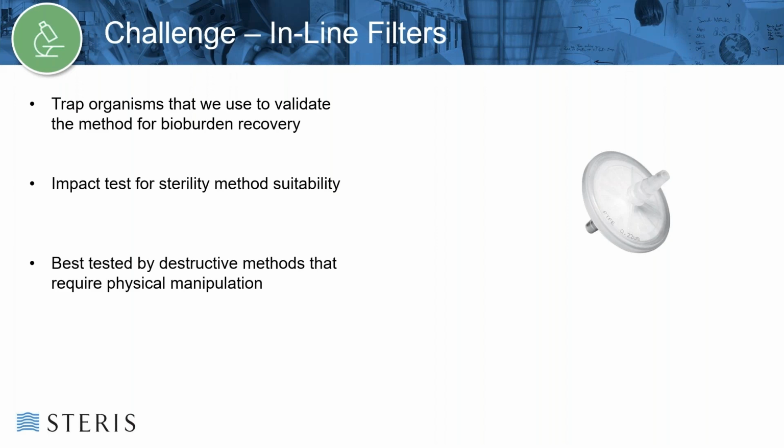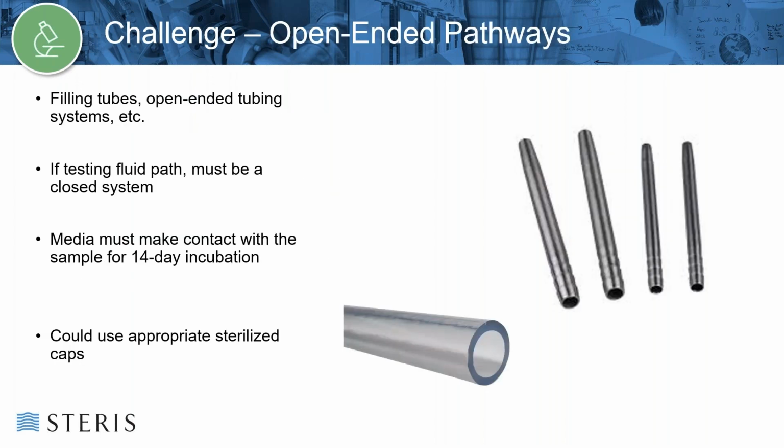They are best tested by destructive methods that require physical manipulation to essentially destroy the housing and then immerse the entire contents as well as the housing. Additional challenges are open-ended pathways, filling tubes or open-ended tubings on the system. If we're testing the fluid path of the device, obviously we can't have open ends, as the test media would just pour out of the end.